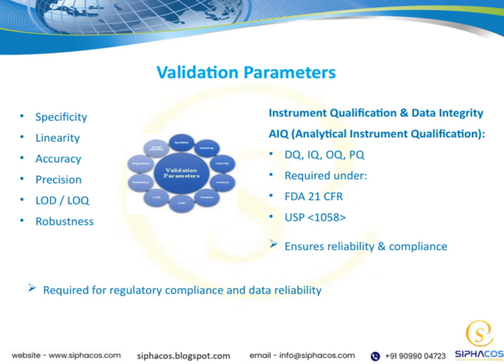To achieve this, we focus on validation parameters such as specificity, linearity, accuracy, precision, and limits of detection and quantification, LOD and LOQ. Additionally, robustness testing confirms that our methods remain reliable under varying conditions. All these measures work together to ensure our instruments are reliable and our data is trustworthy, which ultimately supports our overall goal of delivering high-quality, compliant products.